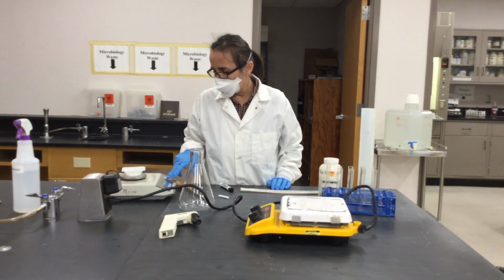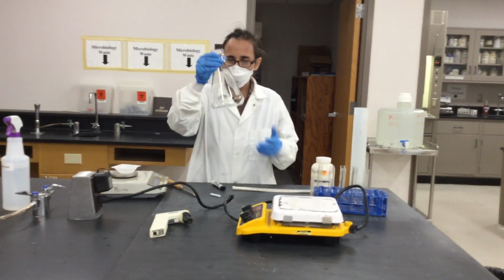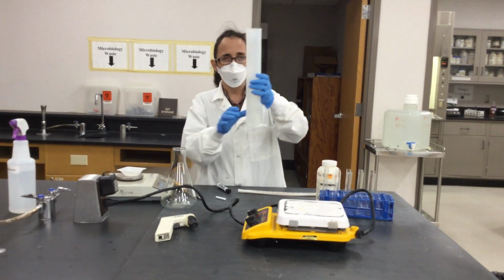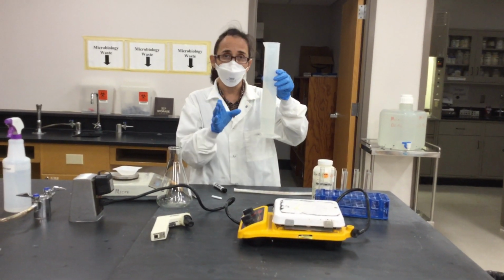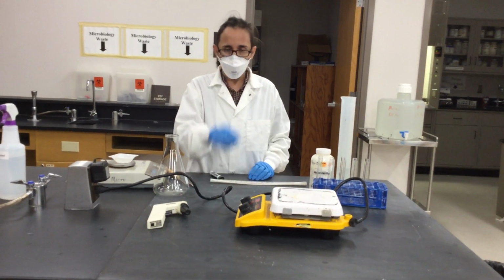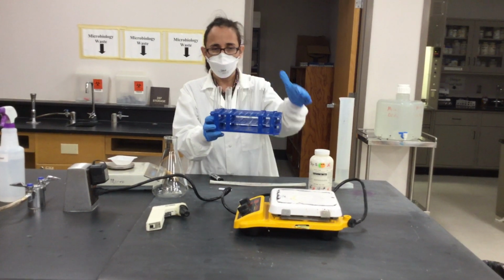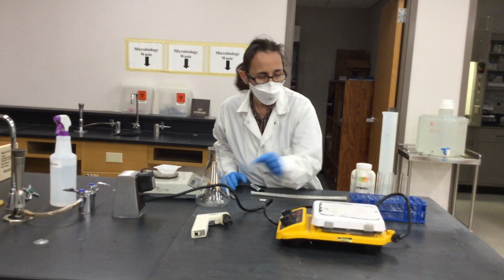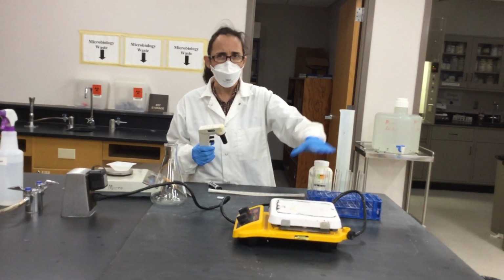So you will have this weight scale, this weight boat, a flask where you're going to add the water and the powder. You have this graduated cylinder with the amount of water that you're going to use. In this case is distilled water, 100 milliliters. And then you have stirrer, hot plate, your test tubes, in this case 10, with your rack that is going to be used for autoclaving the media. And we will have some caps as well.